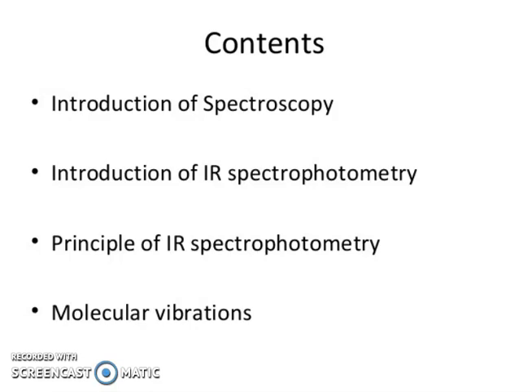So let us start with introductions and principle of IR spectroscopy. I will discuss the introduction of spectroscopy, introduction of IR spectrophotometry, principle of IR spectroscopy and molecular vibrations.